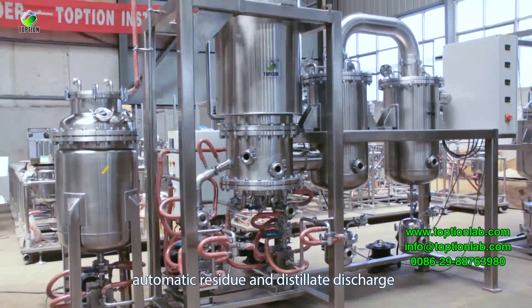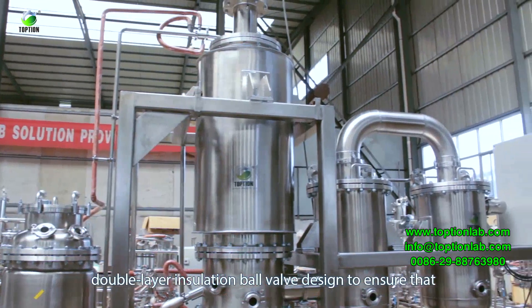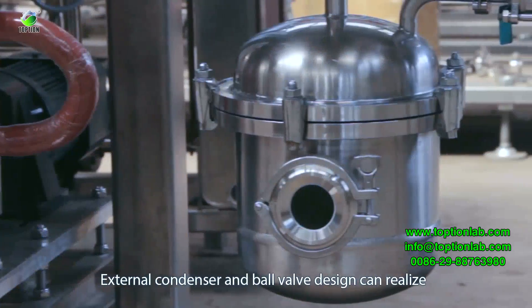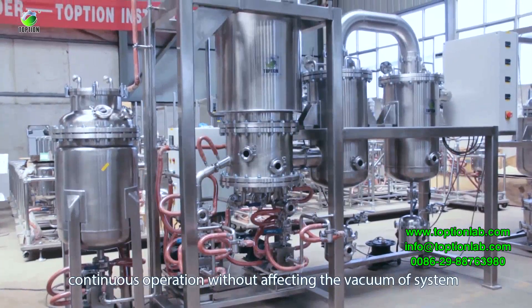The molecular distillation system features automatic light and heavy fractions discharge. A double-layer insulation ball valve design ensures that discharge does not freeze. The external condenser and ball valve design allow continuous operation without affecting the system vacuum.